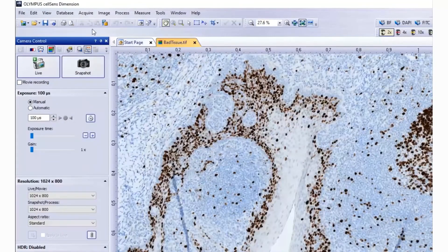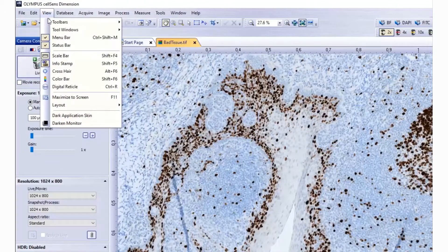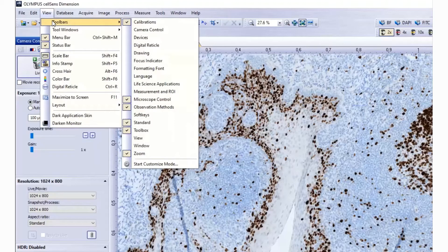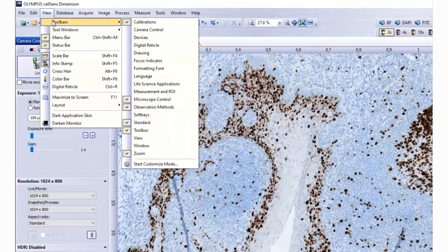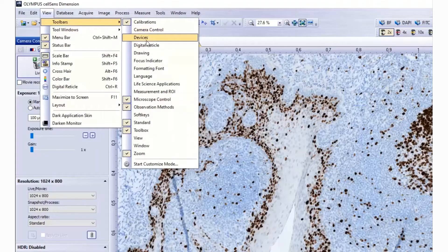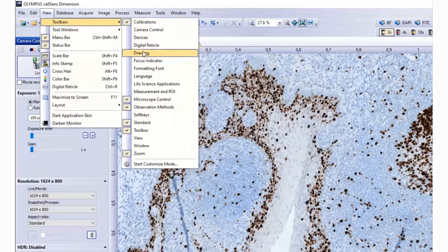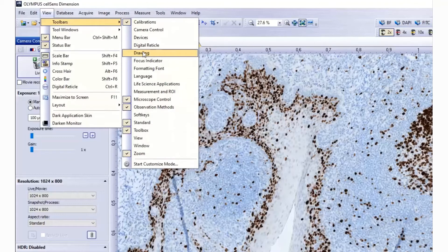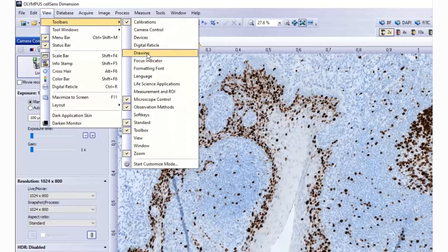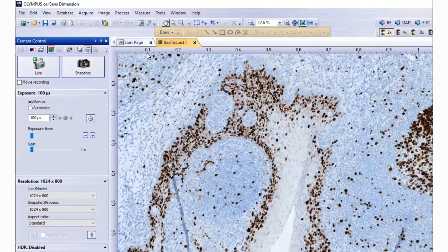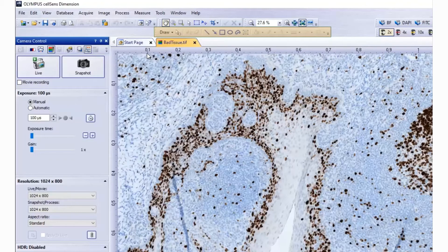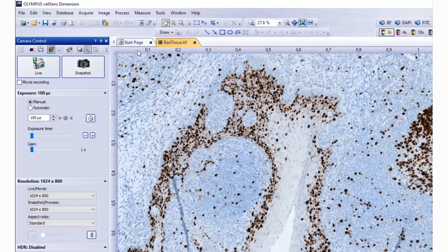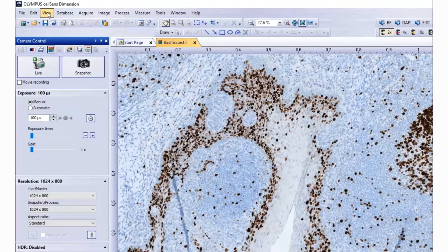Use the View Toolbars command to make specific toolbars appear or disappear. A checkmark in front of the name of the toolbar shows that this toolbar is on display. To make a toolbar appear, select a toolbar without a check next to it. To make a toolbar disappear, select one of the toolbars with a check.